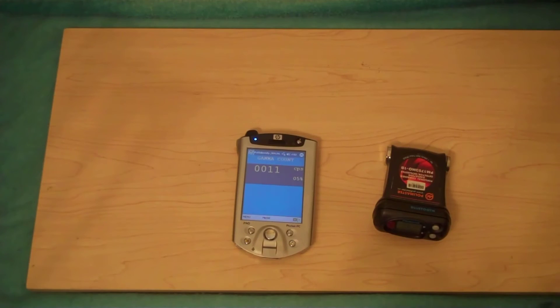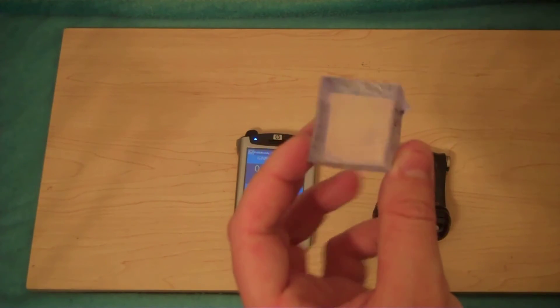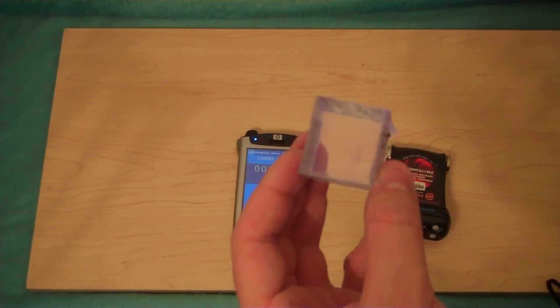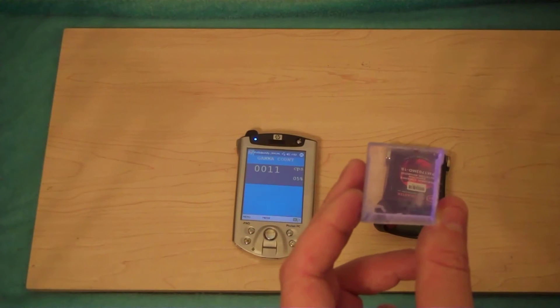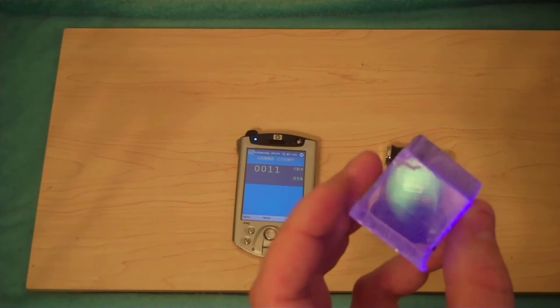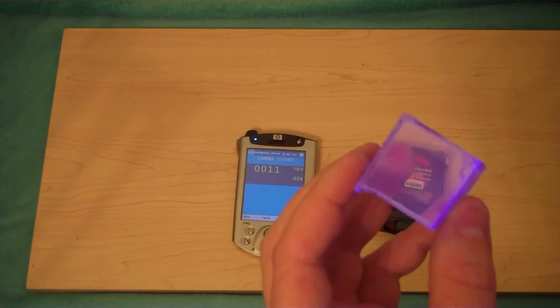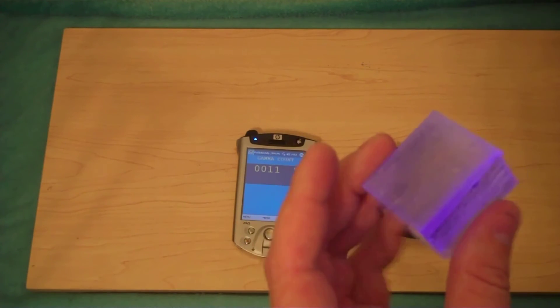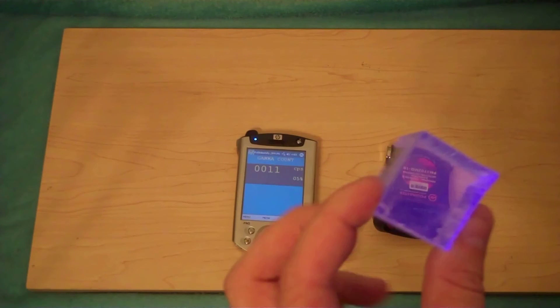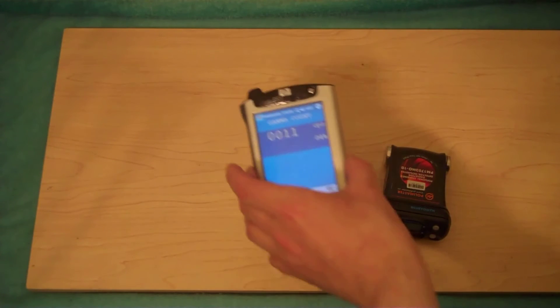You can see it says 'calibration' on the unit. Coming back about 30 seconds to a minute later when it's done — this is a Bikron plastic scintillation crystal, though that's not what's in this device. This device has a cesium iodide, thallium-doped crystal. When radiation is exposed to the crystal, it scintillates. I'm simulating this with a black light — obviously you wouldn't see this with the naked eye at very low levels of radiation. The cesium iodide, thallium-doped crystal inside this little pager does the same thing when gamma ray energy hits it, emitting light with an intensity proportionate to the energy that struck it.